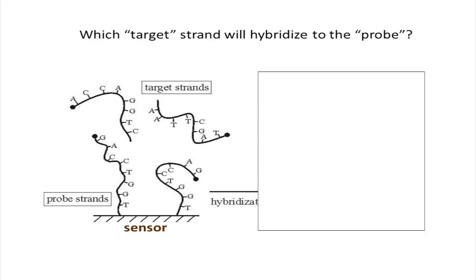So it's simple. You take single-stranded DNA, and all the technologies, all the companies that were on the prior slide, you attach the single-stranded DNA to the surface of your sensor, and then you use it to fish out the corresponding sequence from your sample. And if it's present, you get hybridization. If it isn't, you might get some less hybridization, there may be some cross-hybridization, non-specific interactions, but generally the signal is going to be less.